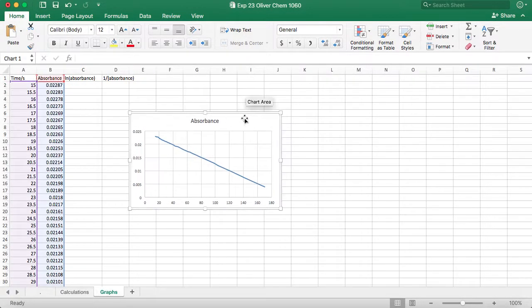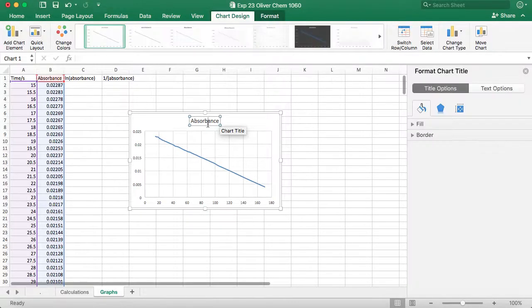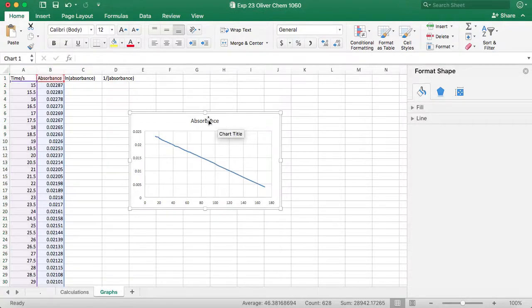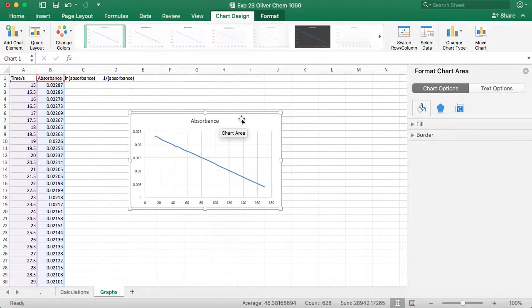So I'm going to label this one in my table. Oh, nope, didn't mean to do that. Excel is wonderful, but after several years, I still feel kind of like a noob when it does that.